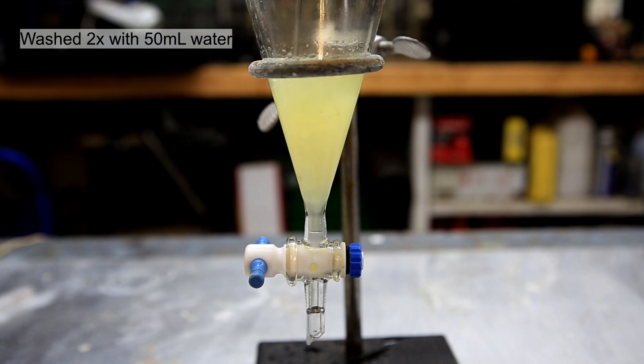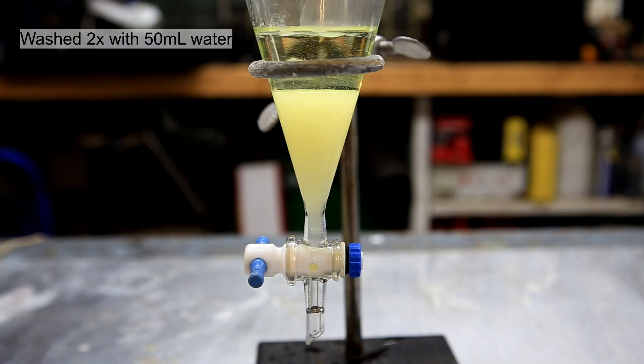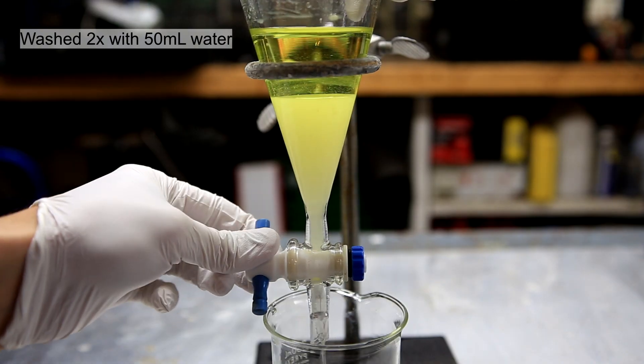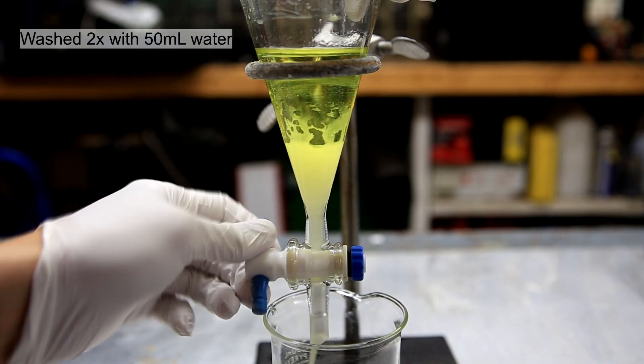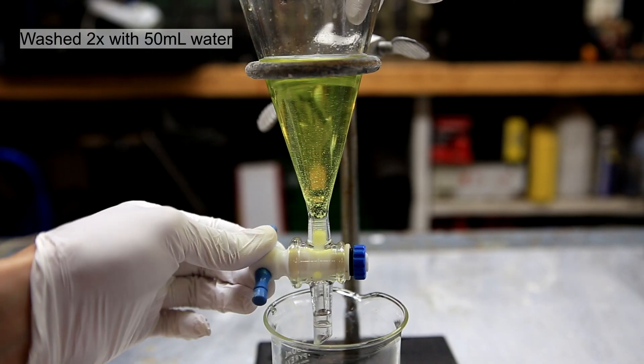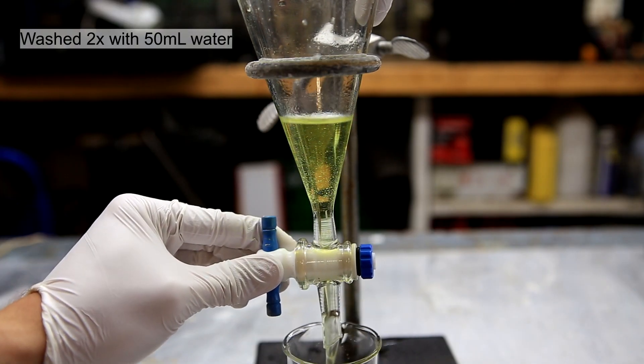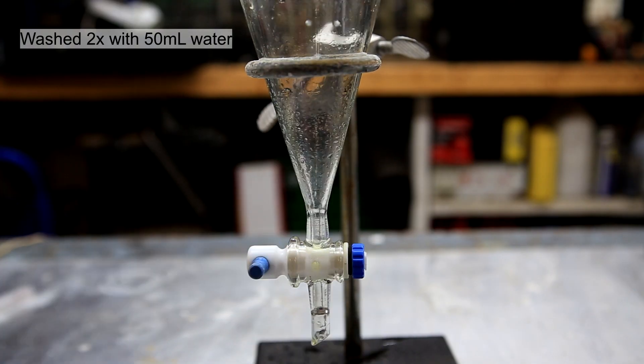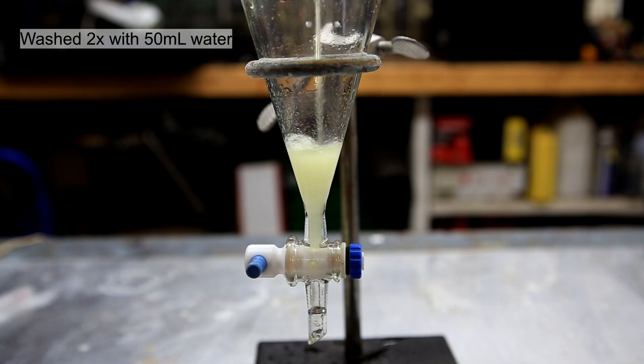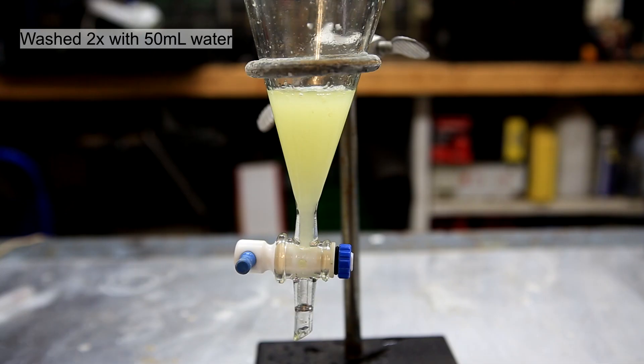The upper layer containing the nitrobenzene is washed twice with 50 milliliters of distilled water. Washing it with water allows for the removal of any acid that might remain in the nitrobenzene. Nitrobenzene is denser than water so it becomes the lower layer and this is the layer that should be retained. The nitrobenzene is slightly soluble in water so the water does become a faint yellow color. Because there are trace amounts of the nitrobenzene in the water, it's important that the water is disposed of correctly because nitrobenzene is actually quite toxic.